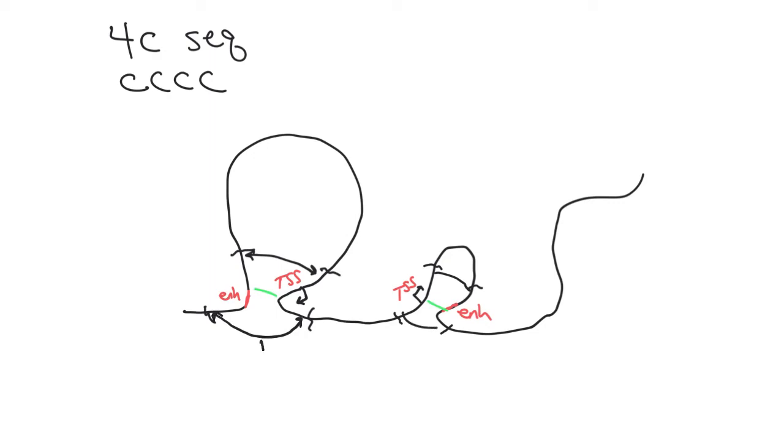So basically what this winds up making then is a circular molecule where the enhancer is over here and the transcription start site is over there. And if we showed where those chromosomes broke, it would be, for example, there, those two ends ligated together, and the same for the other two breakpoints. So in other words, that breakpoint is here, stuck together with the end of that breakpoint. And the same up here, that end where the chromosome was randomly broken during this process ligates to that end there.